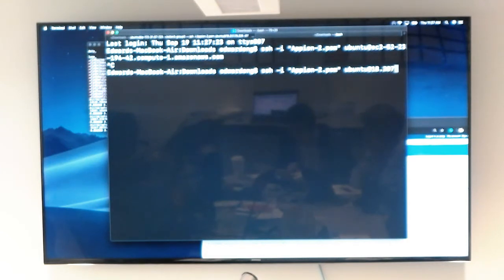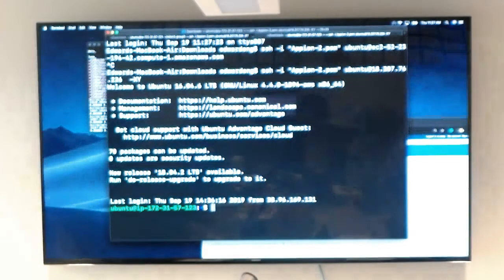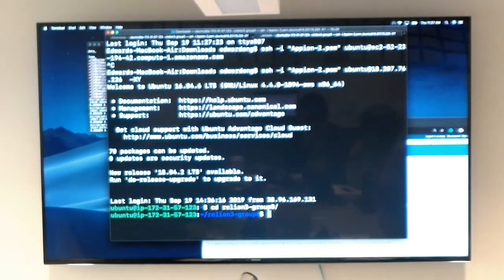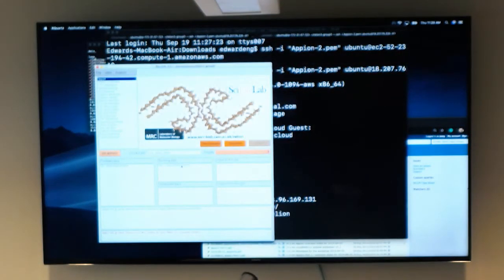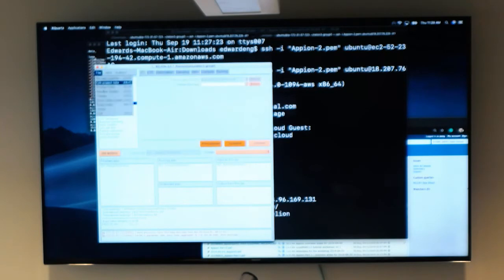Select the model star file. Model star, so it will be this one. This is the latest, version 9. Let's give 15, no more than 20. Display. Well, patience is fine. It's still low, we still need to wait.